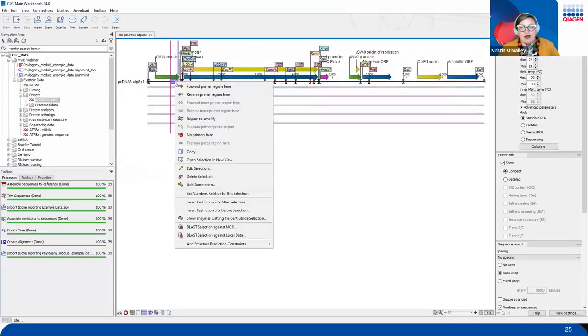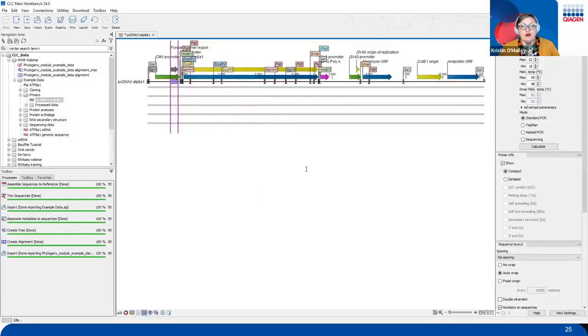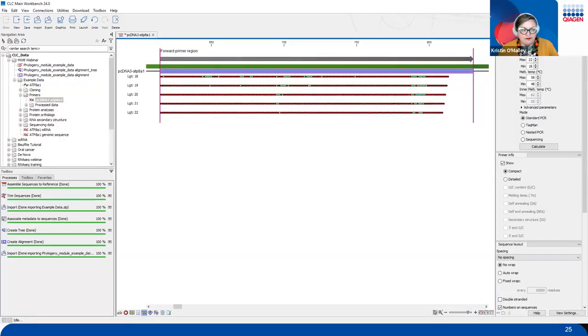We're going to right click on the blue purple area, and the very first option here is going to be forward primer region. What this is going to do is tell CLC, hey, we want the forward primer to sit somewhere in this area. Then using the zoom tools at the bottom here, I'm going to go to the selection tool right here and zip right into our selected region, where now you can see all of these dots showing up on all of these 5 lines that are populated on the primer design screen. First things first, each one of these individual lines is specifying different length primers.